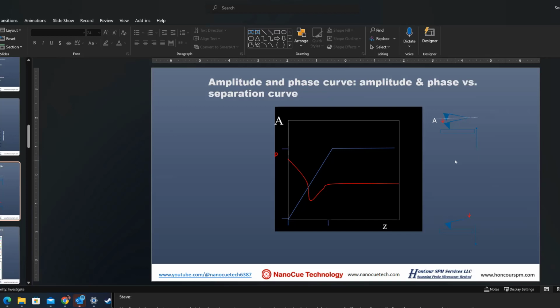For example, electrostatic force. If you're imaging in liquid, you have an OH bond on the sample and an OH bond on the tip, and you do a force curve, there's still a pull-off attractive force. That's obviously not because of a water layer, because it is in the water, or in the liquid. It's just a different way of seeing it, and it's consistent with all the observations. Does that answer your question?